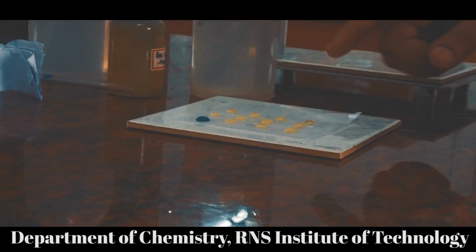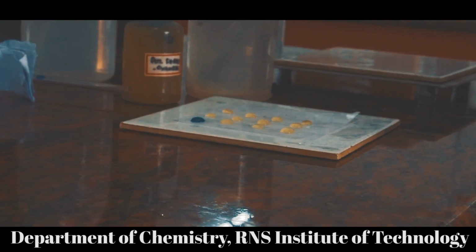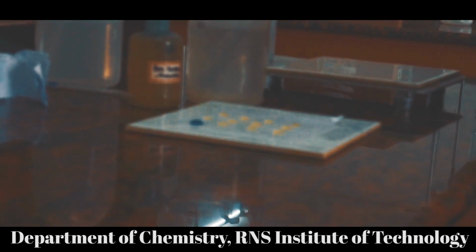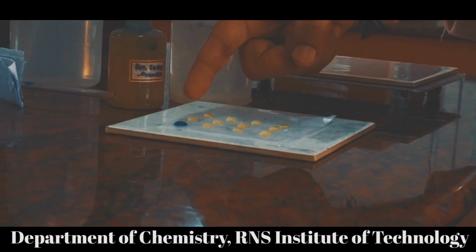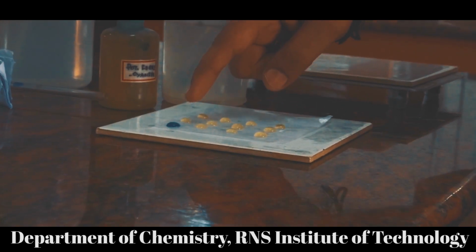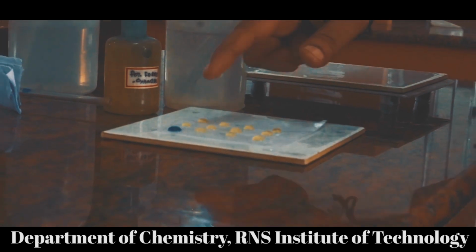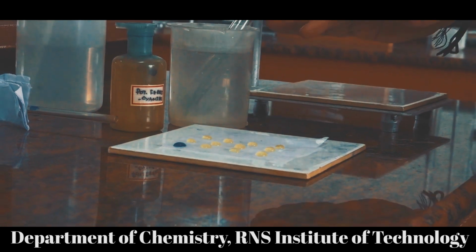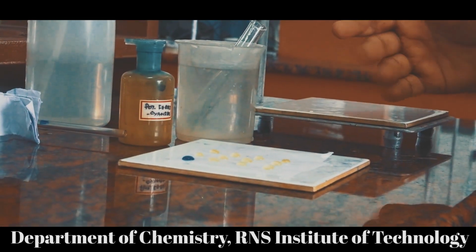It is because this indicator is able to react with only Fe2+ ions of the solution. If Fe2+ ions are there, then only it is going to form an irreversible potassium ferroferricyanide complex, and that will be Turnbull's blue color in nature. So you are getting blue color like this if the reaction is not completed. If you have not reached the end point, you will get it.